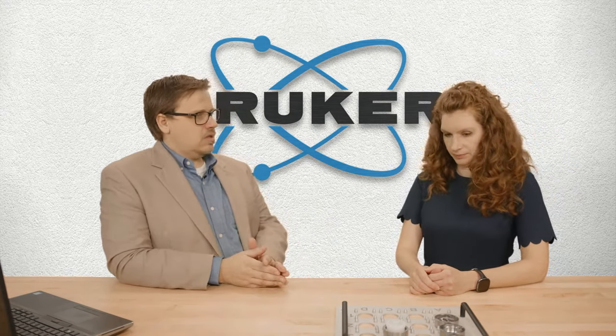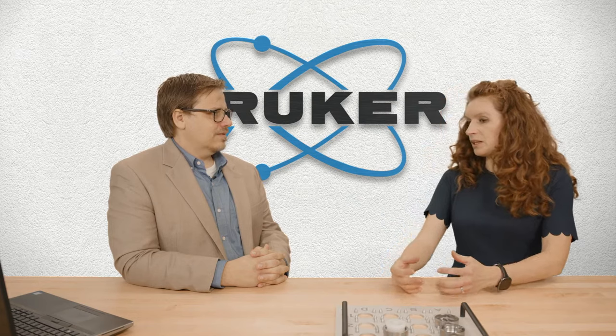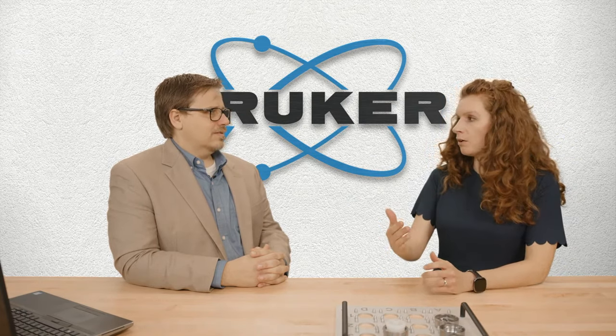Yes. The sample preparation is key. Not only that you're executing properly, but that you're doing the right sample prep for that method. It also is important to not only look at the elements that you're interested in, but other elements that are present. That's especially something for food and feed, because not everybody might be interested in silicon that might be in the plant matrix, but it's there and it can influence the rest of it. With the EDXRF, that's one good example, because we measure the whole spectrum. We don't have to spend extra time on it. We can look at the spectra when the calibration is set up. We can see, oh, the silicon changes a lot, so let's take it into account. Oh, the silicon is the same, let's not worry about it, because the influence will be the same for everything.